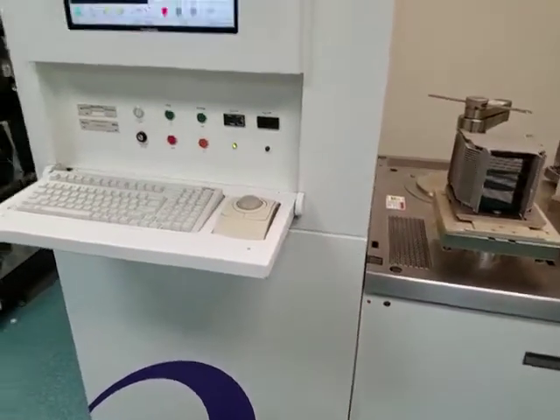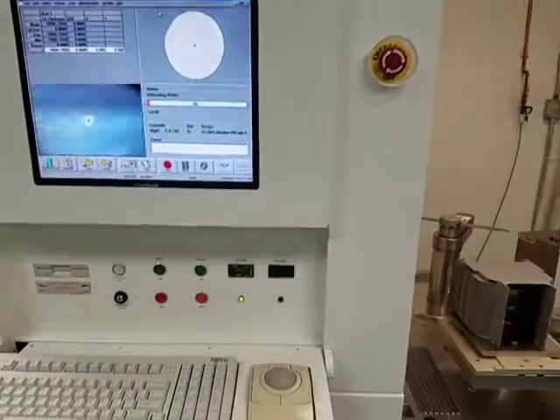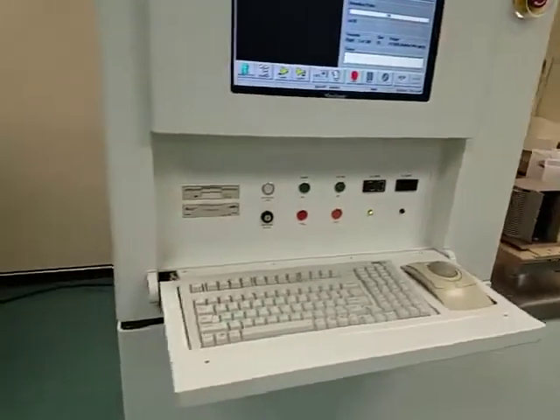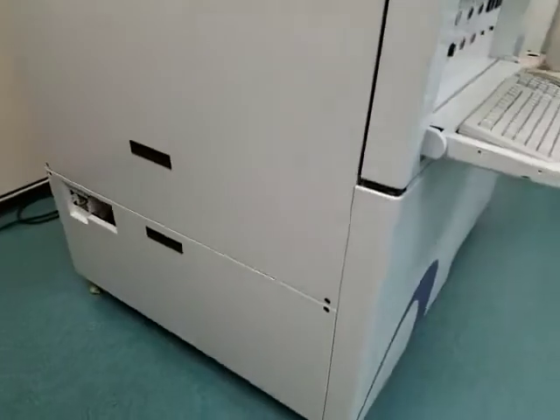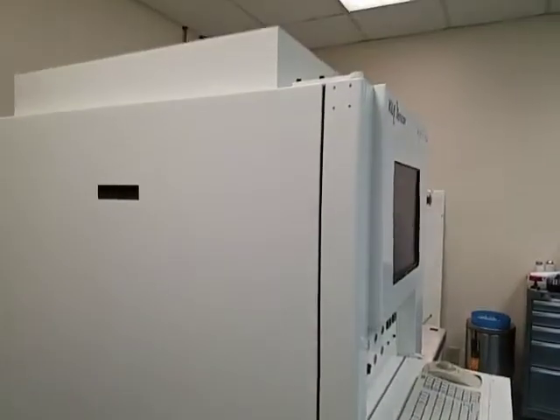Jazz drive, USB drive, and DVD drive are included. Computer was upgraded to Windows XP. All the circuitry was verified, working or repaired.